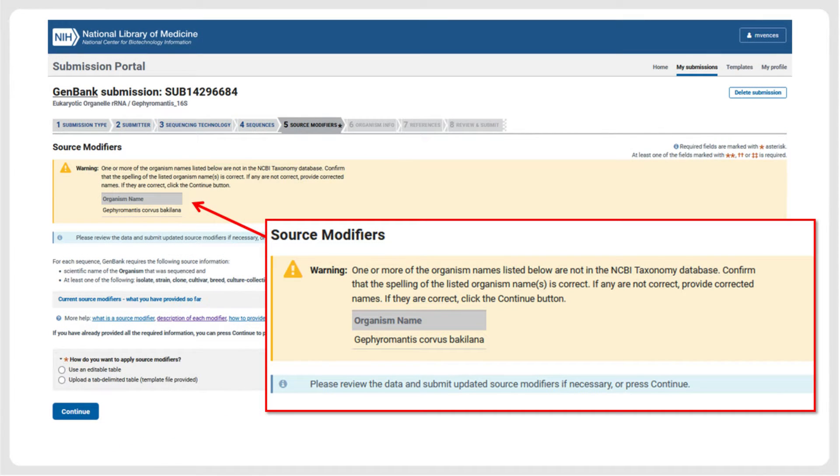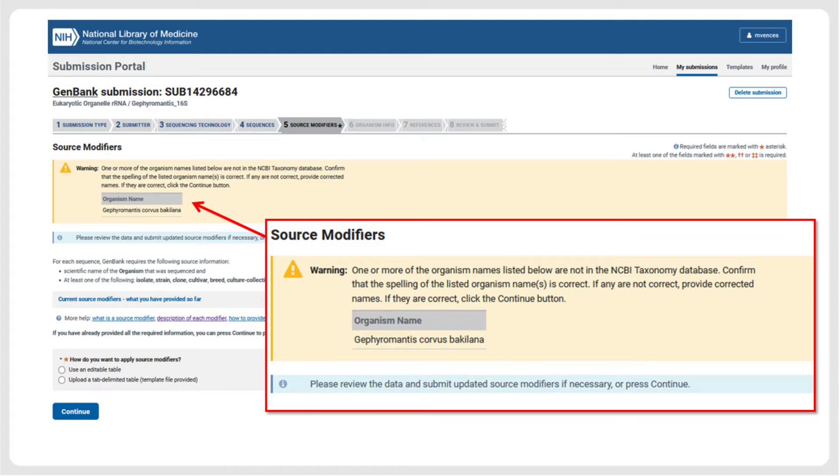The automatic quality control often encounters minor formatting mistakes or other errors. In our example, it noted that one name is not included in the GenBank taxonomy database. If this was due to a typing error, we need to correct it and re-upload the FASTA file. In our case, the unrecognized name is a new taxon, so we simply press the Continue button.